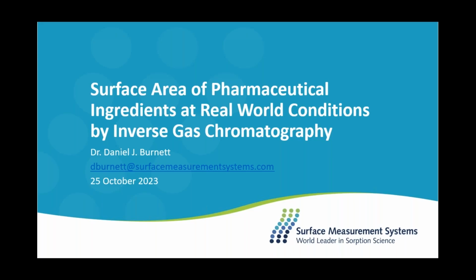Thanks, John. Appreciate the introduction and the nice introductory video to inverse gas chromatography and the IGC SEA. I will very briefly talk about the technique, how to measure surface area by inverse GC. But the bulk of the talk will be some case studies and why you might want to measure these at real-world conditions, or process, storage and control relevant conditions, as opposed to cryogenic temperatures and vacuum conditions, which is typically required for most traditional surface area methods.